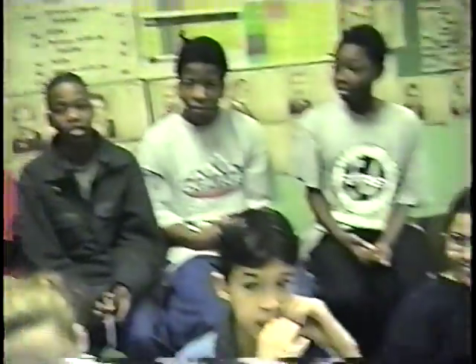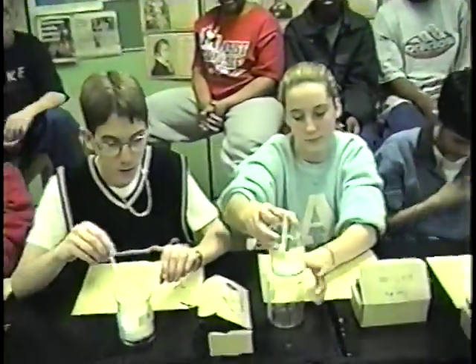Okay, and Shama, you have H2O, which is more commonly called water. And what's another way of writing H2O? HOH. Okay, so we now know what chemicals we're working with, and how much water should we use to mix them up? 100 milliliters, which is two fifties. Now, there are 3 sinks around this room. I want you to take out that bottom beaker and go put in 100 milliliters.